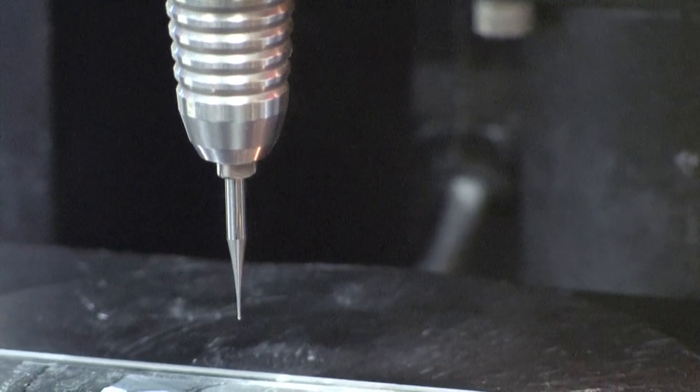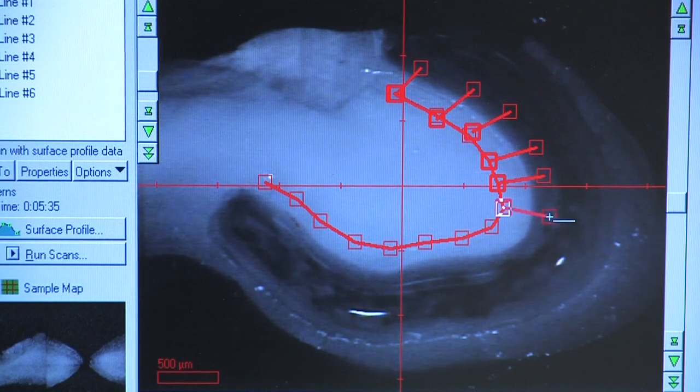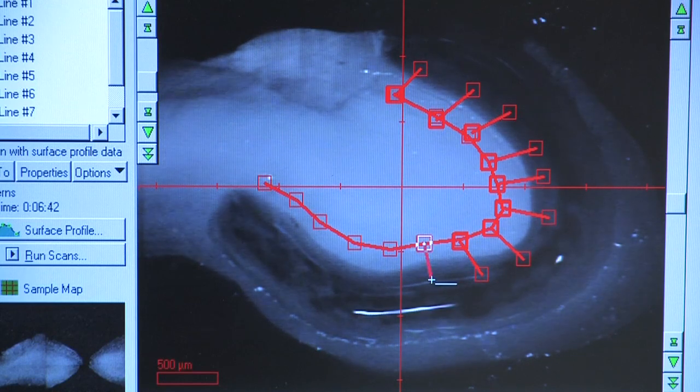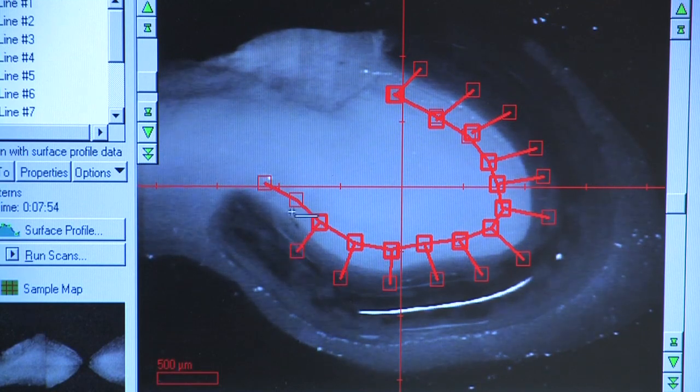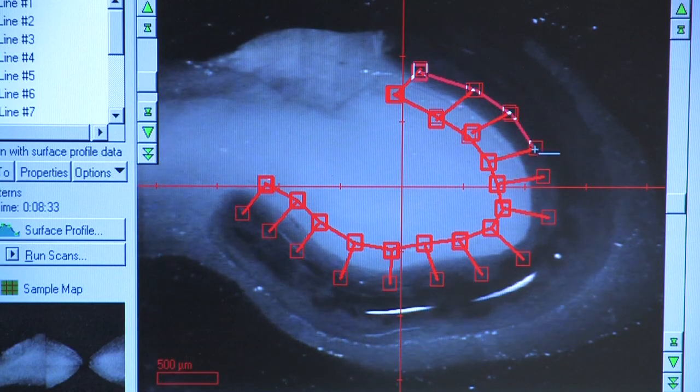Make sure you use the 003 round burr bit. Draw perpendicular lines 185 microns out from the new line's curve and then connect these end points of these lines to obtain a new secondary line.